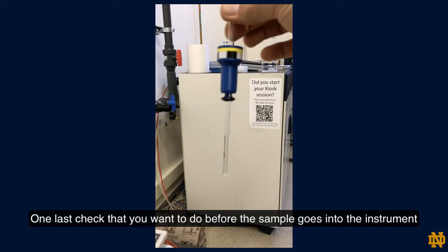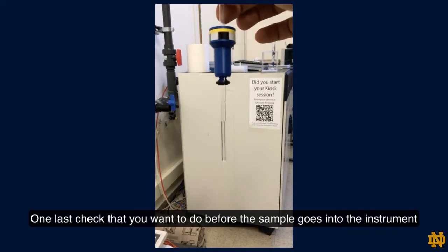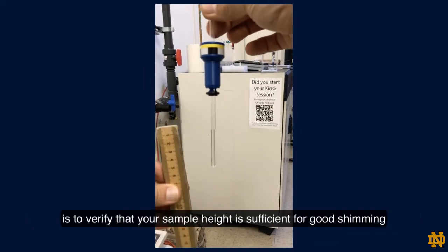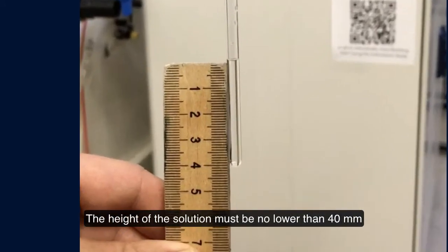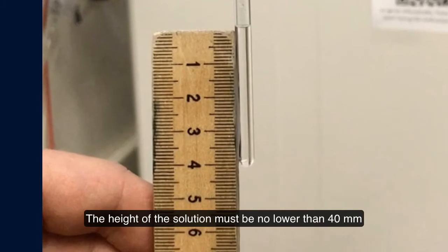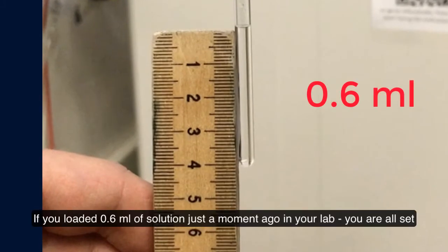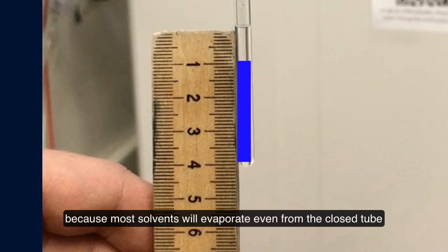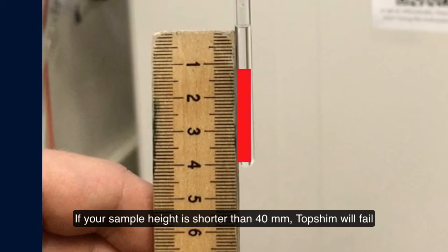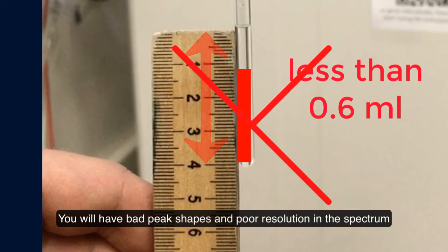One last check before the sample goes into the instrument is to verify that your sample height is sufficient for good shimming. The height of the solution must be no lower than 40 mm. If you loaded 0.6 ml of solution in your lab, you are all set. If your tube was sitting for a while, you should check the height, because most solvents will evaporate even from a closed tube. If your sample height is shorter than 40 mm, top shim will fail and you will have bad peak shapes and poor resolution in the spectrum.